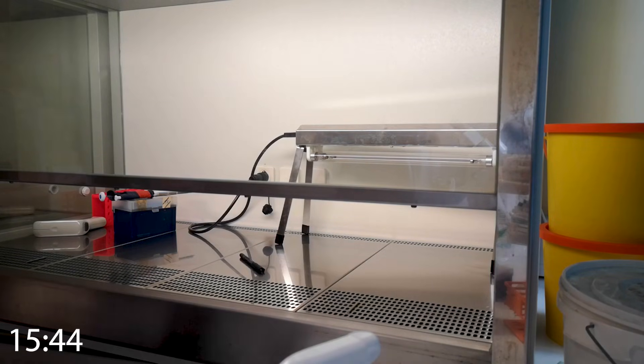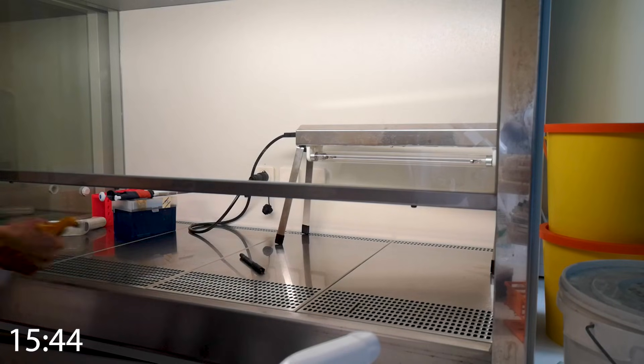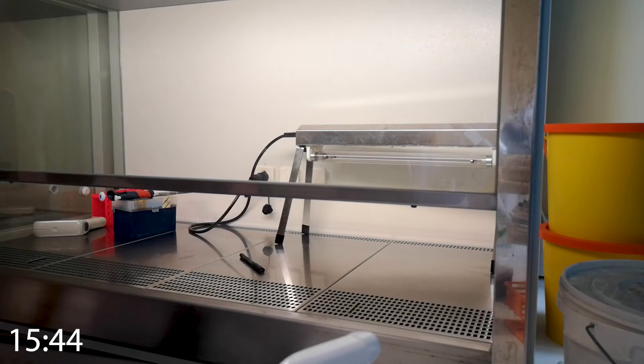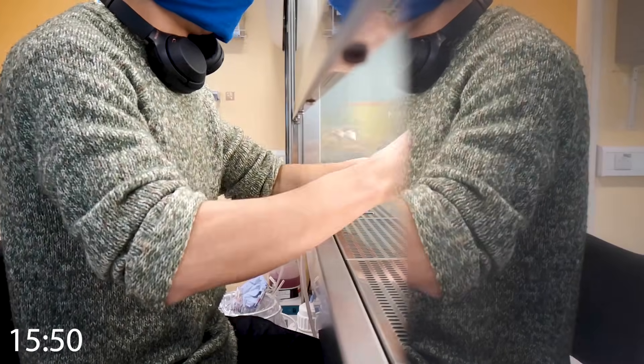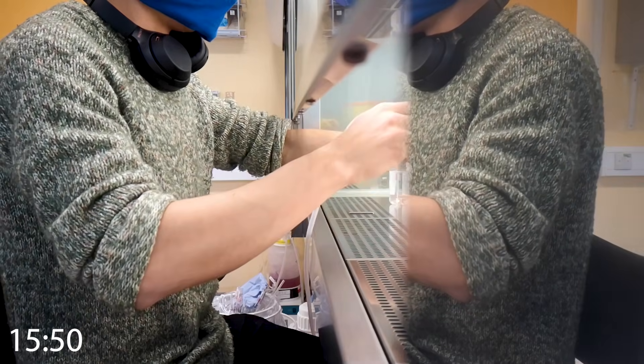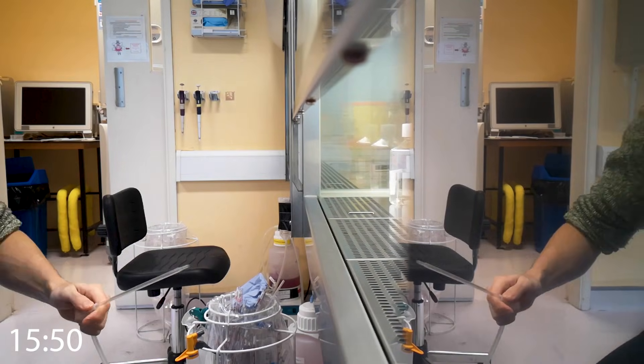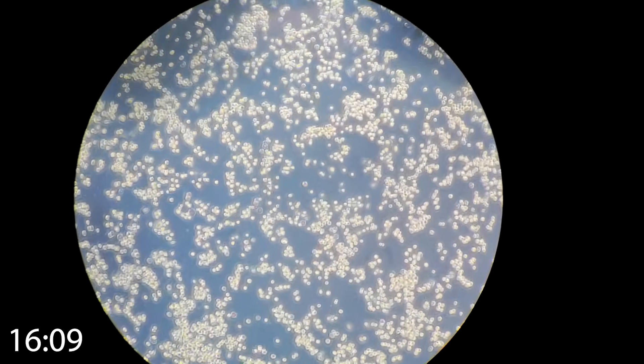I then sanitize the fume hood, which is where I need to be working and it needs to be as clean as Boris Johnson's criminal record. I'm just kidding, it needs to be a lot cleaner. What I'm doing now is adding an enzyme called trypsin to my cancer cells, and this enzyme causes the cells to stop sticking to the plate by breaking down surface proteins. And as you can see, it's made my cancer cells go from this to this, so it's working.